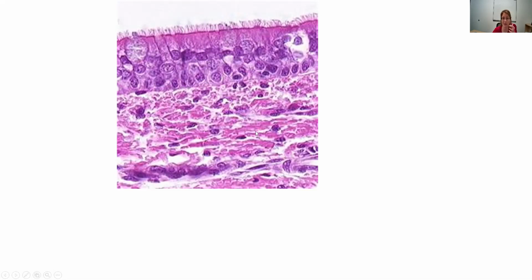Like I said, this is not a very good picture, but I did that on purpose because you could get all kinds of slides, some that are perfect and really good and some that are a little torn up. Well, I can kind of see this line right here. So this is one type of tissue, and then this is a different type of tissue. If my pointer's up here, then I've already gone through how I identified this as pseudostratified ciliated columnar epithelium.